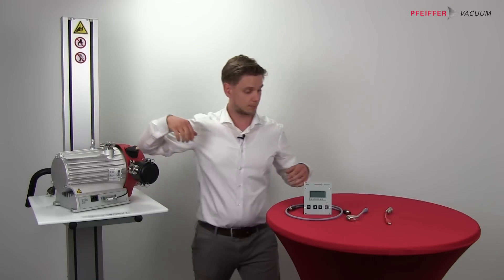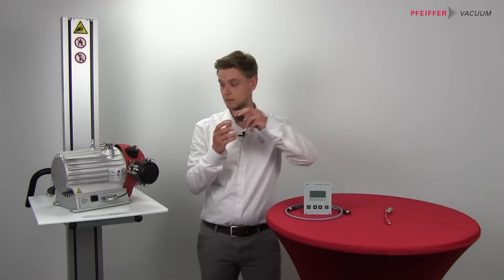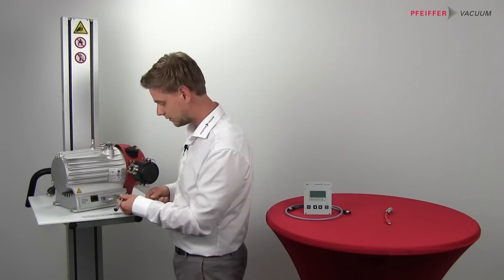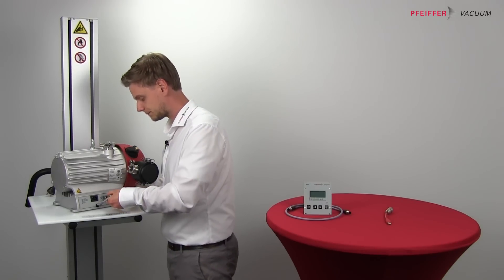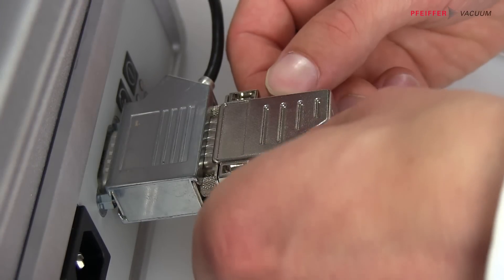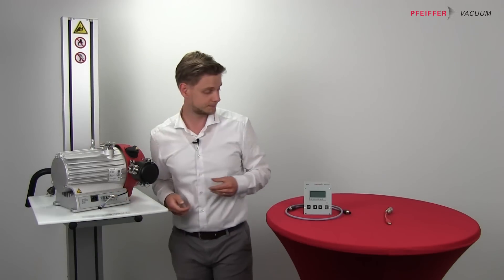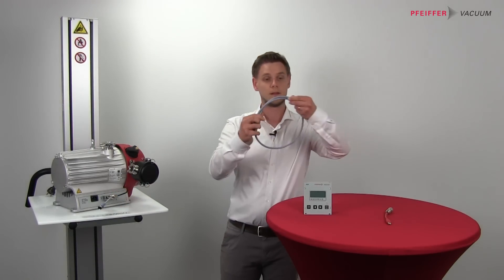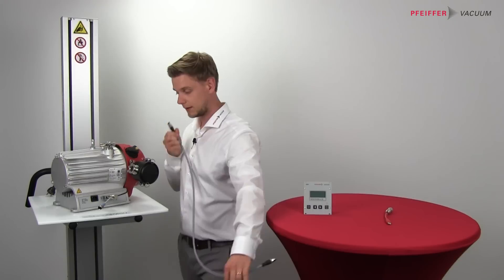In the next step I will install the adapter for the RS485 connection. Then the RS485 cable.